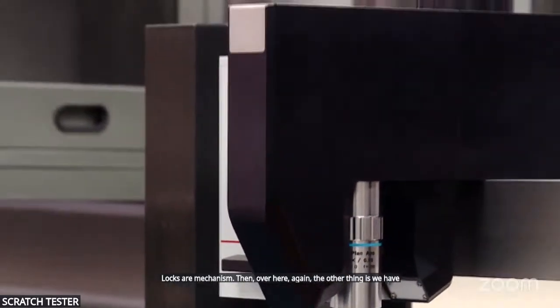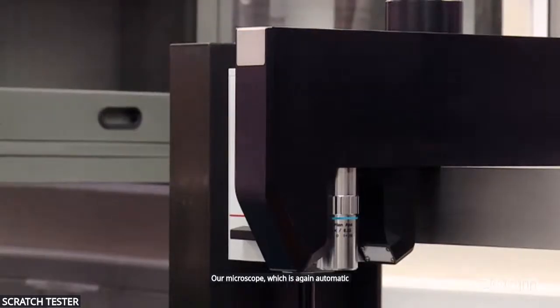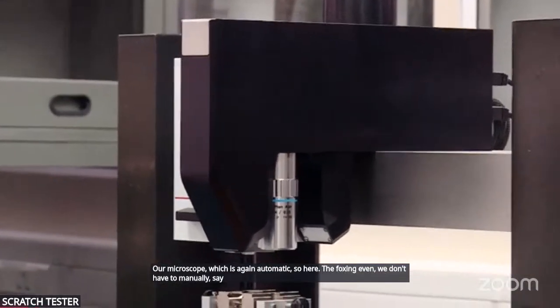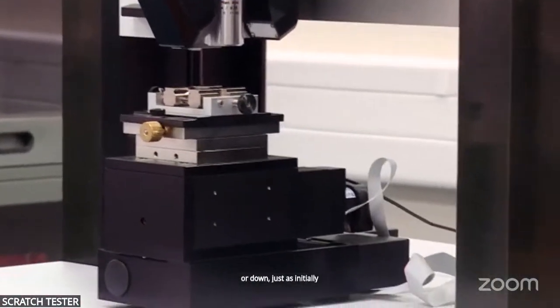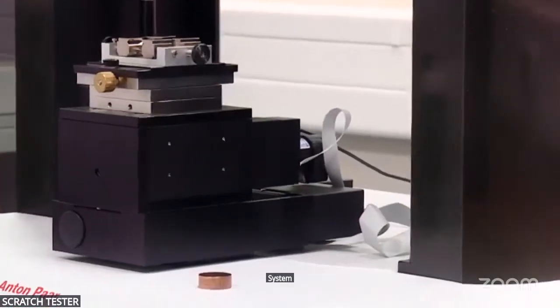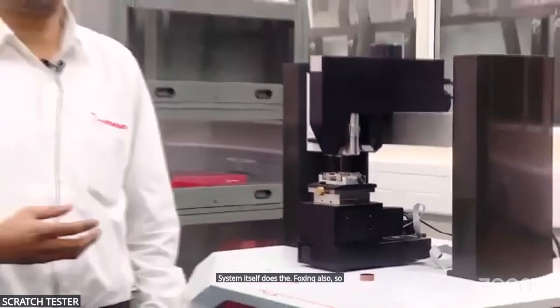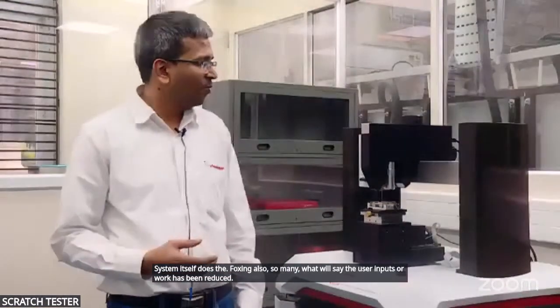Then over here, the other thing is we now have our microscope, which is again automatic. Here, even for the focusing, we don't have to manually move the sample up or down. Just as an initial movement we have to do, and then the system itself does the focusing also. So many of the user inputs or work have been reduced.